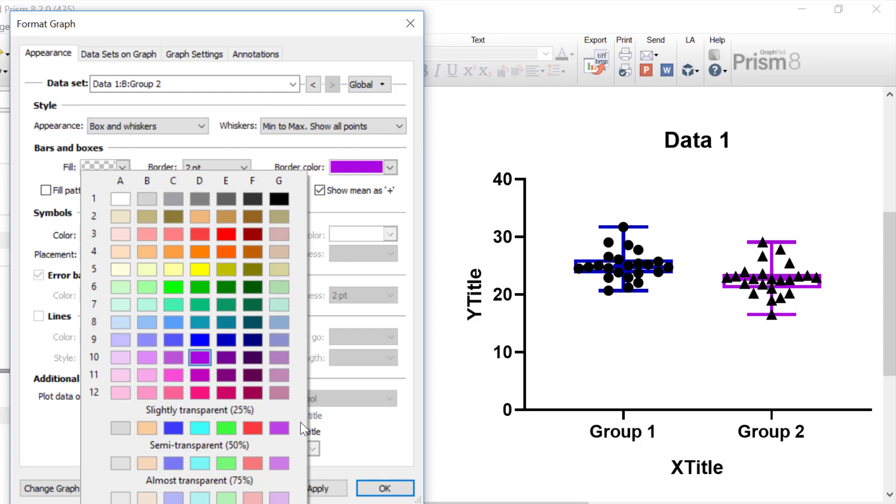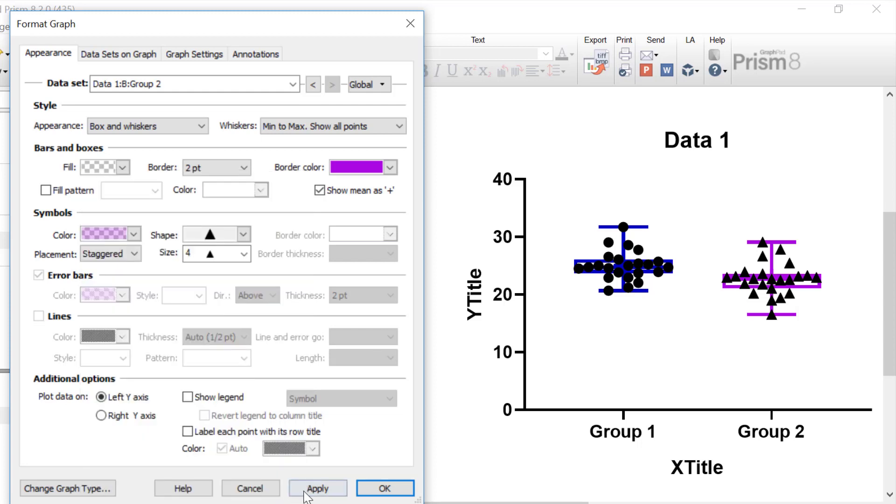So for my second group, I'm going to select to have a transparency of 75% and select the same purple color and then click the apply button. So notice now that in the second group, you can faintly see all of the data points. This currently works well since I don't have that many data points on my graph. If I have quite a lot of data points, you might think about not showing all of the data points and just having a box and whisker plot or alternatively using a violin plot, which will better show the distribution of the data set.